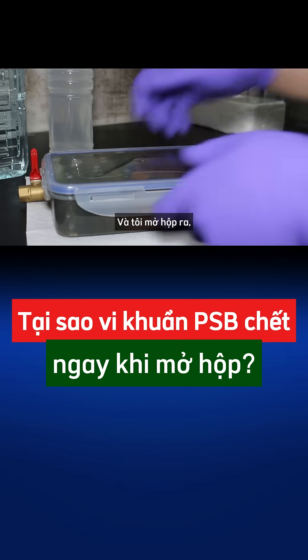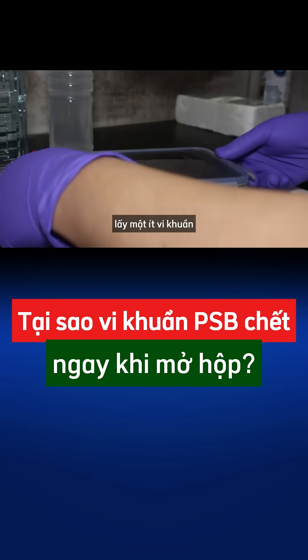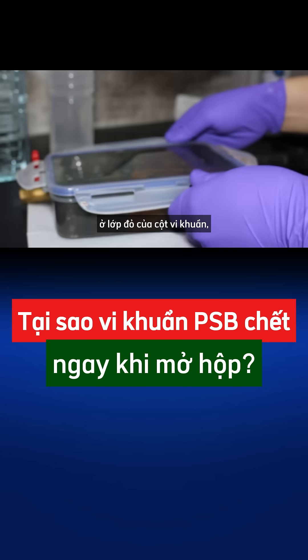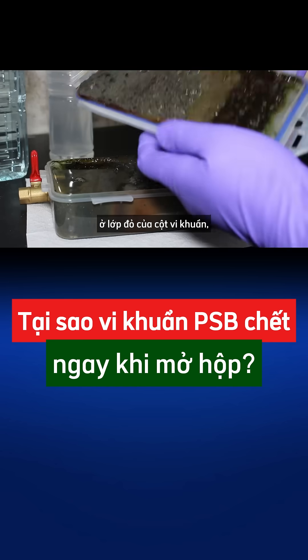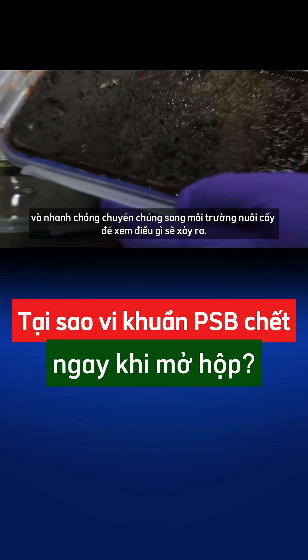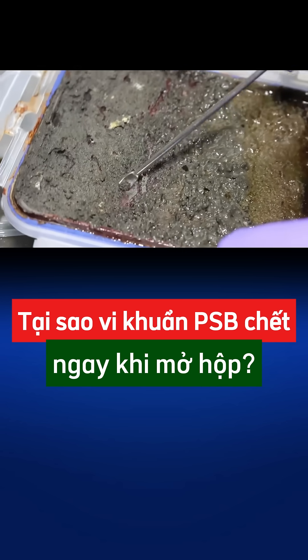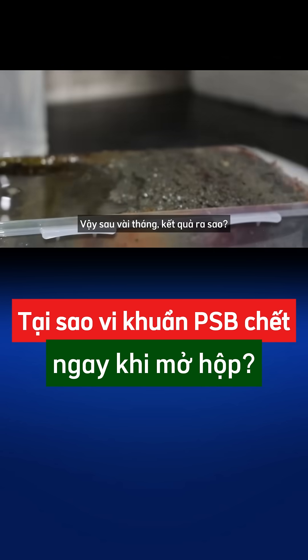I opened the box, took some of the bacteria from the red layer of the column, and quickly put them into the growth medium to see what would happen. After a few months, I checked the results.